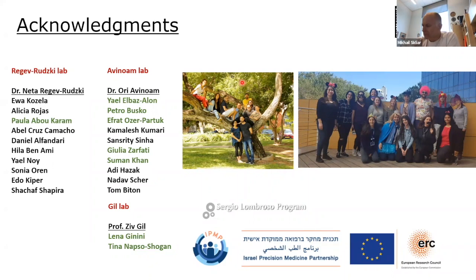Thank you. Okay, with respect to the first part, in the images I show you can't really tell, but in some cryotomography you do see protein decoration on the surface of the EVs. It's much sparser than you would see in a virus. The virus is a very dense brush, but you can still see some protein on the EV surface. Probably like shadows, like excess density. They're not so structured, but you see some dots surrounding, especially in tomography, because you're reconstructing, you can see it a bit better. And obviously the artificial vesicles have none, they have only lipids.